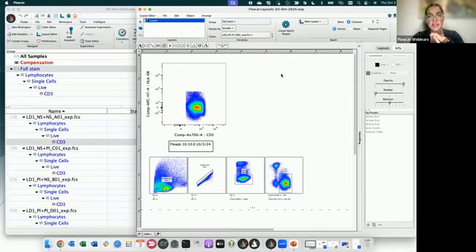So these are different staining names or different parameters eventually. FlowJo will use a combination of those parameters, and if these are not matching your new sample, then it is going to be difficult for the software to find the exact match. So you may see populations not show up. So these are the conditions to have a template working well.